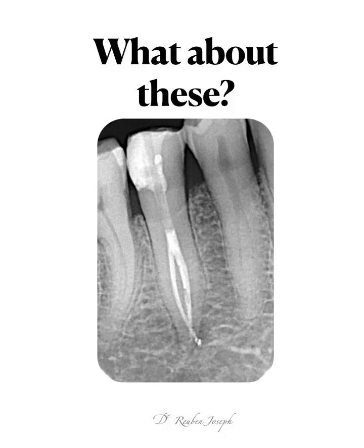Of course, the best solution is to have a microscope that has a brilliant light source, but then if there is a constraint in that area, how can this be managed? That's exactly what we're going to look at in the next few slides.